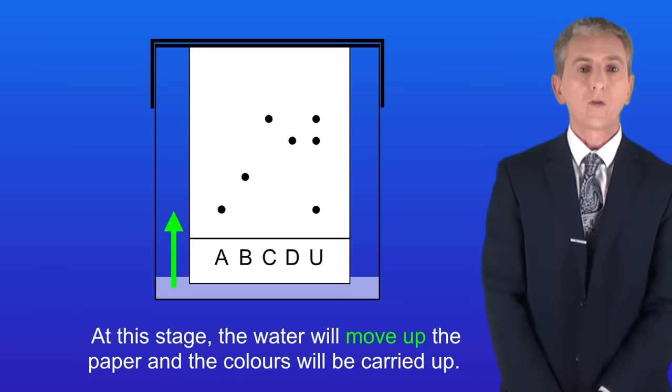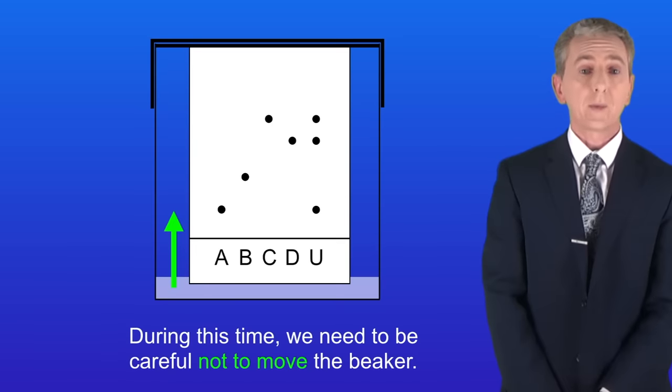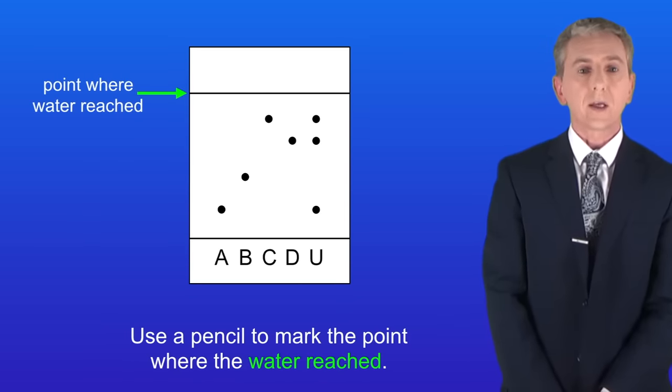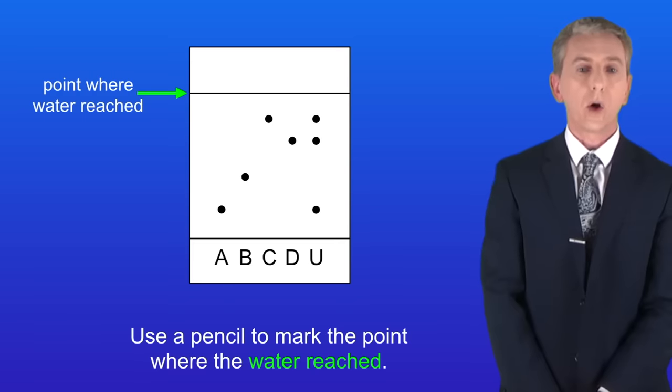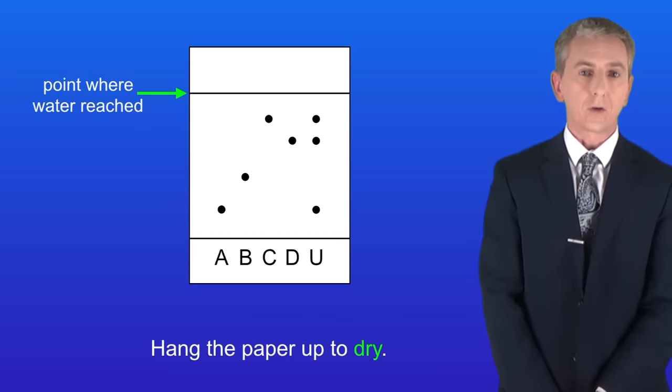Now at this stage the water will move up the paper and the colors will be carried up. During this time we need to be careful not to move the beaker. We remove the paper when the water has traveled around three quarters up. At this stage we use a pencil to mark the point where the water reached. And finally we hang the paper up to dry.